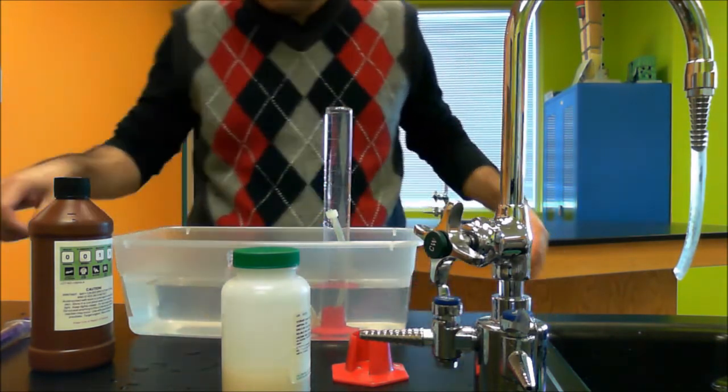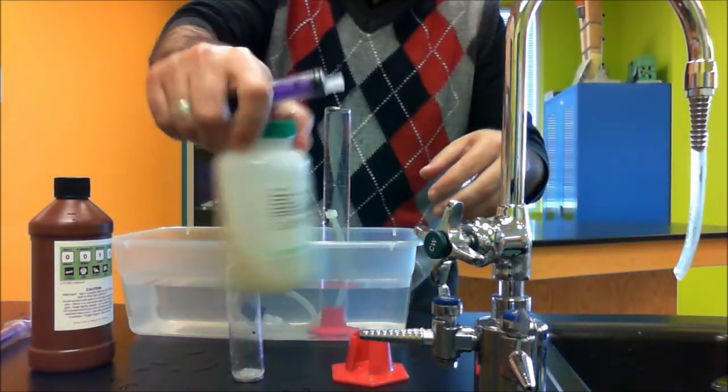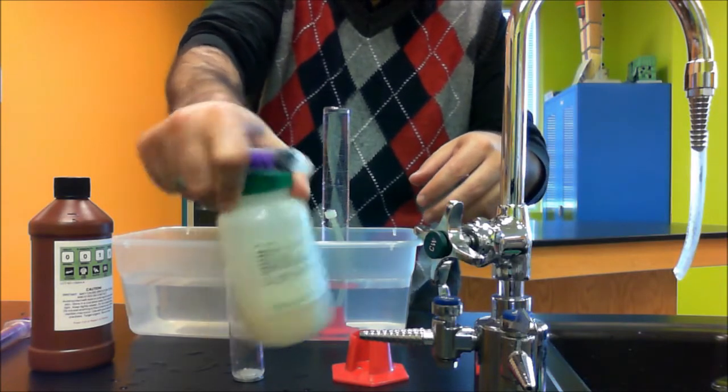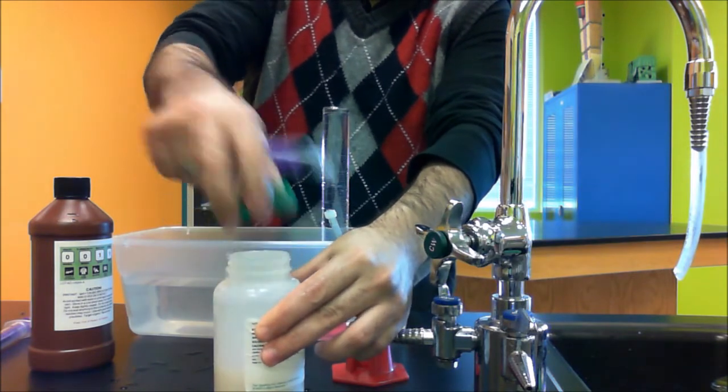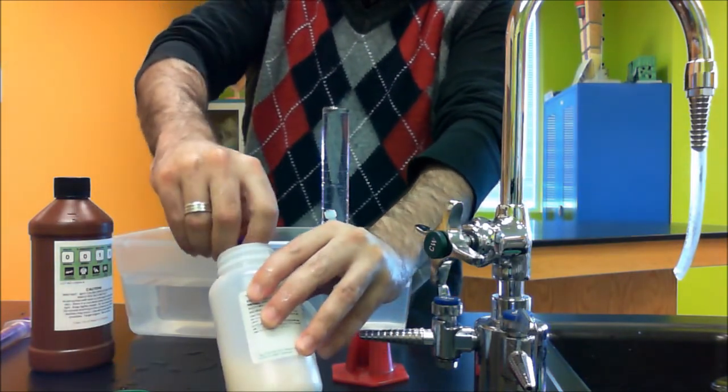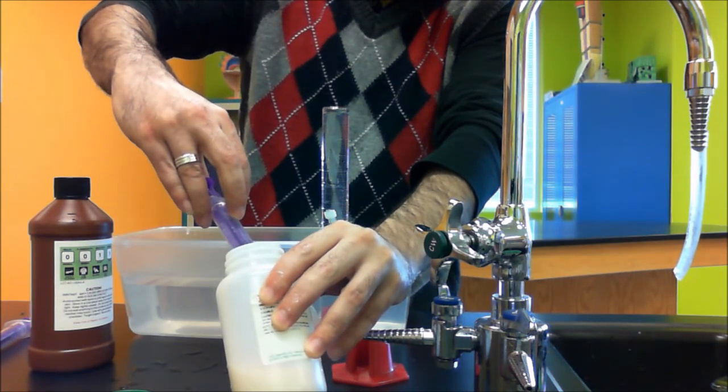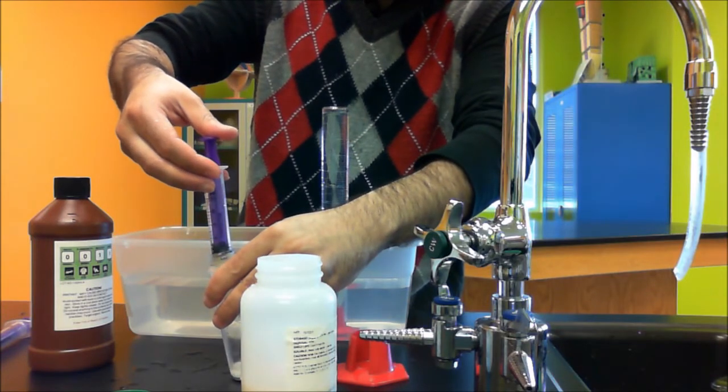Now next, you're going to use your syringe and your yeast suspension. It's important to mix it before you take your yeast sample. Take three milliliters of yeast suspension and add it into your glass vial.